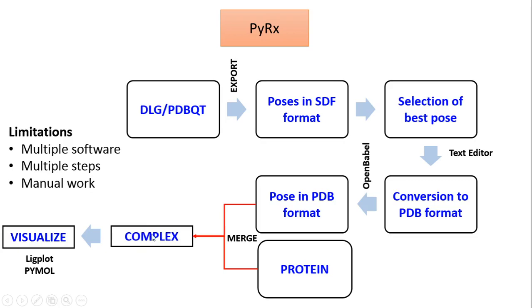And the finally generated complex is later visualized in any visualization software like LigPlot or PyMOL or RasMol or whatever it is. So the major limitation of following this kind of workflow is that it relies on multiple software.